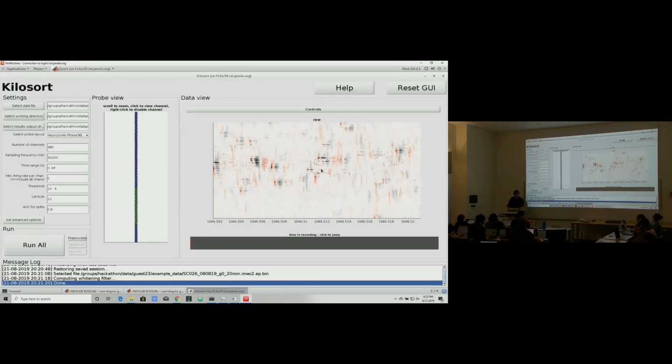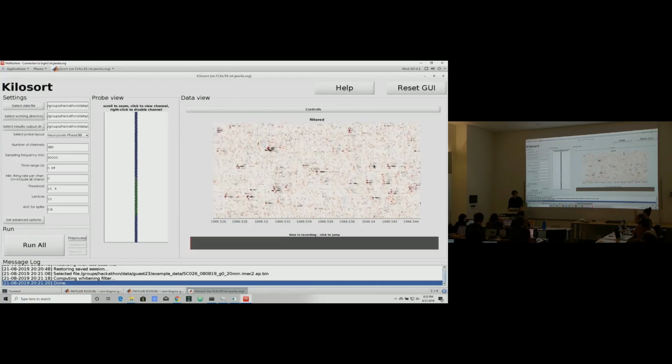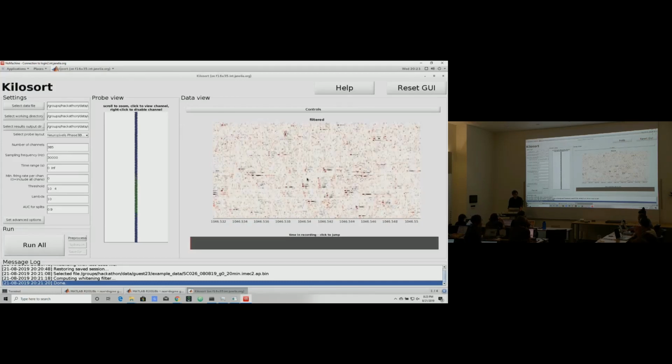What looks like is happening, if you look at it closely, is that all these fields extended over many channels of every spike get canceled out. Only the big parts on the central channels are really the stuff that's discriminative, that's very different from spike to spike. And that is the part that we're going to use to do the spike sorting. So just keep that in mind: if your filtered data looks like this, it's actually a good thing. There are all these very different patterns on these spikes.